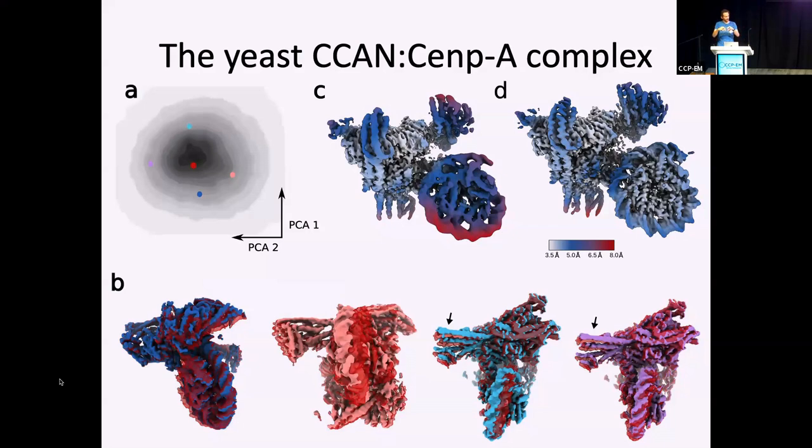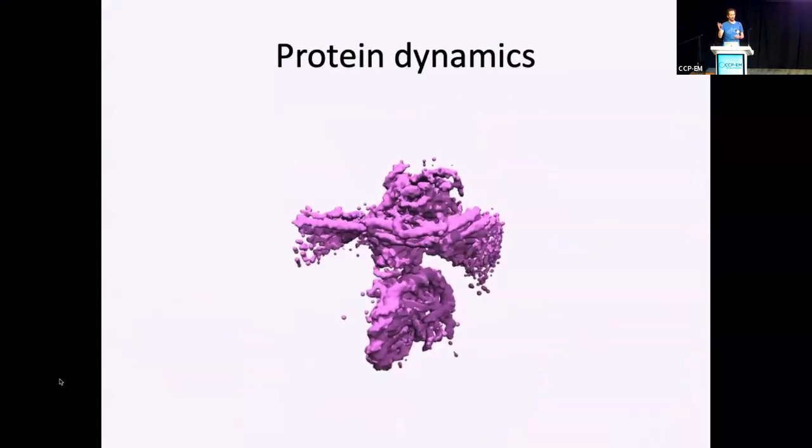If you now do the improved reconstruction with the deformed back projection, then you get this local resolution map. Look, for example, here at the DNA around the nucleosome, and you'll see that all the local resolutions have improved quite dramatically. So you can make much better maps using DynaMight. And this is now a movie of different maps as we walk along latent space. Okay, but you could make a movie of this in any case. Are these rotations that you see of these domains actually happening in the data, or is it some sort of overfitting? At least that the map has become better resolution using these types of motions is an indication that some of this is probably real.